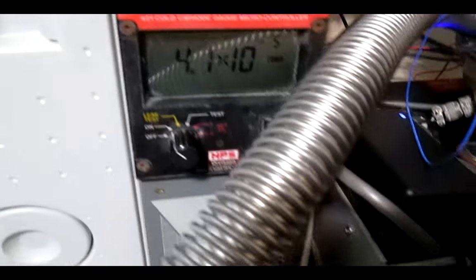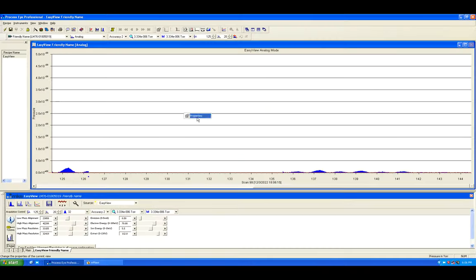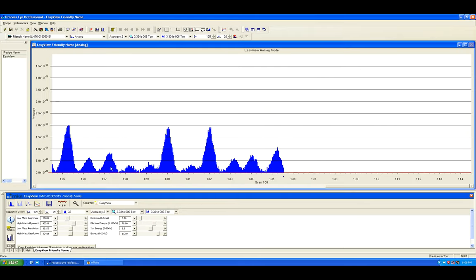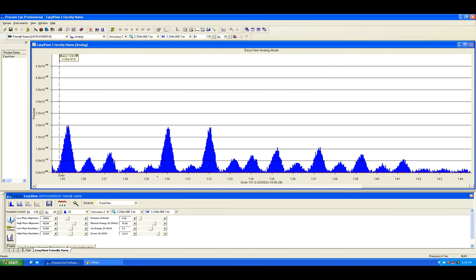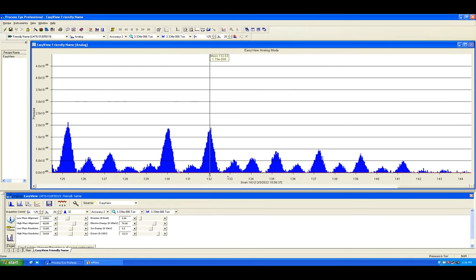And maybe I'll keep it going longer and try to finally capture xenon. There's many more cool stuff to do with the RGA, and I'm looking forward to reading your comments and suggestions.